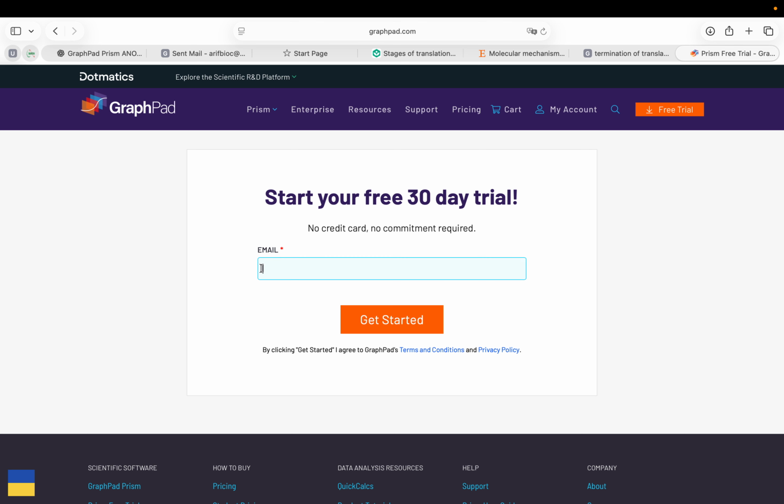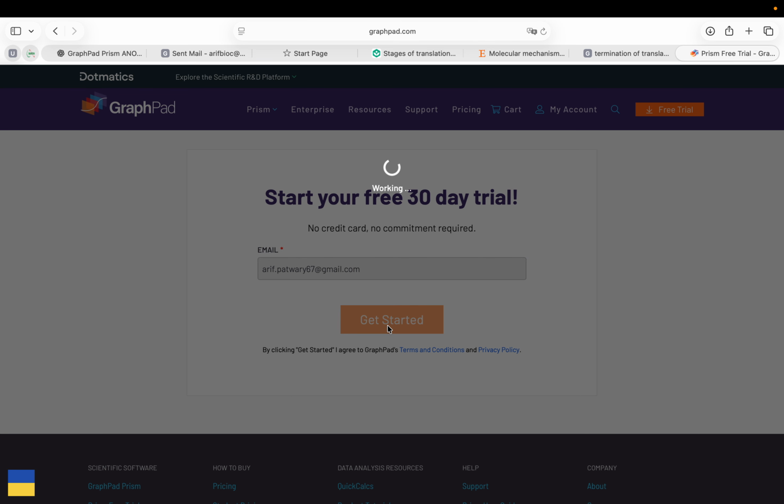And then you will just put your email address, for example in my case, gmail.com, and then you will go directed.